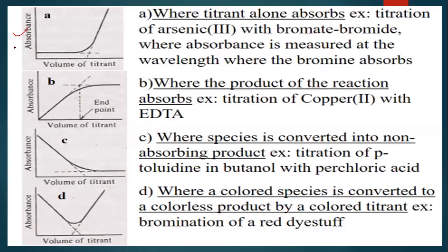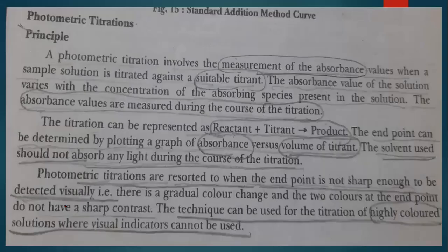These are the titration curves, four types of titration curves. And this is what the last sentence was about, this graph, or this. Okay, now what is the principle?